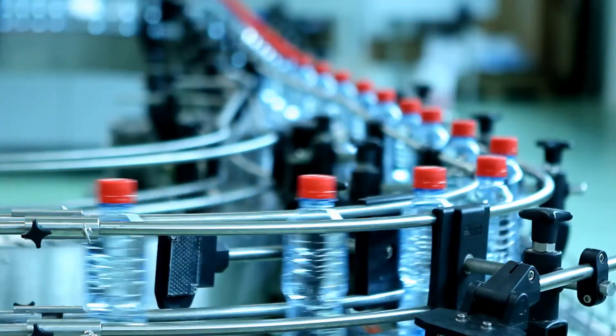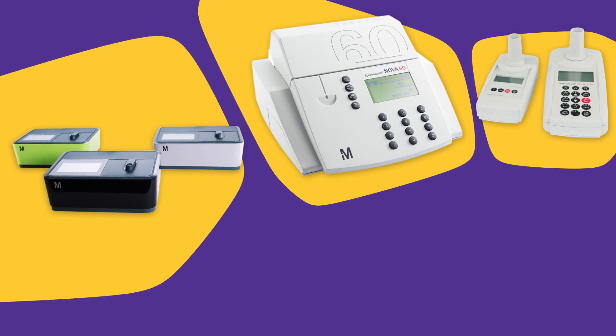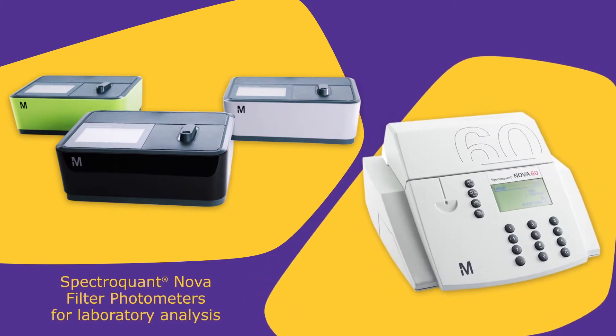The Spectroquant family consists of our PROVE, NOVA, and MOVE instruments. For laboratory analysis, the most suitable spectrophotometers are the PROVE 100, 300, and 600 and the NOVA 60A.